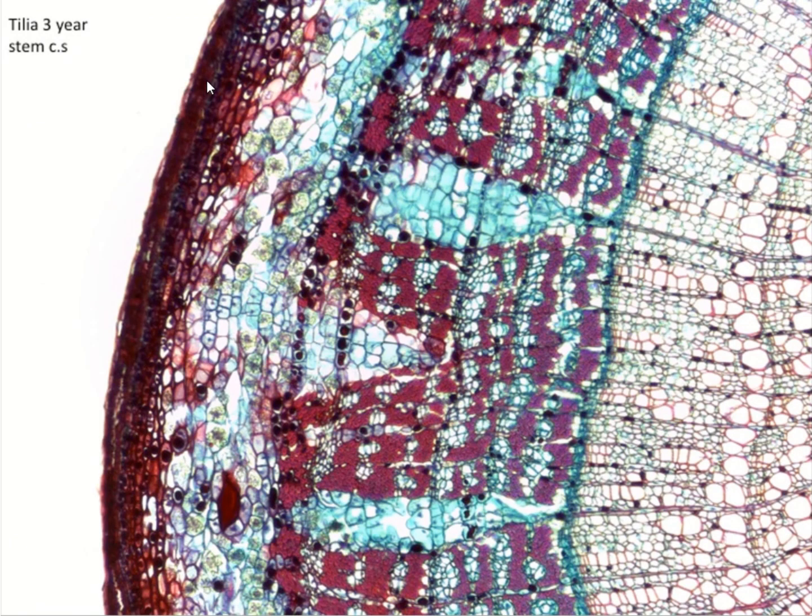So here's a zoomed in region again of the same image from before. We have our epidermal layer, our peridermal layer, then we have our phloem and xylem, and then the growth rings. So it's just a zoomed in layer to give you a better idea.